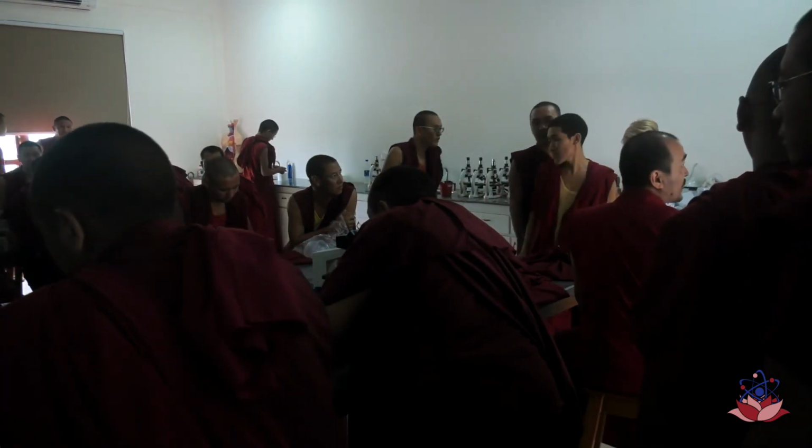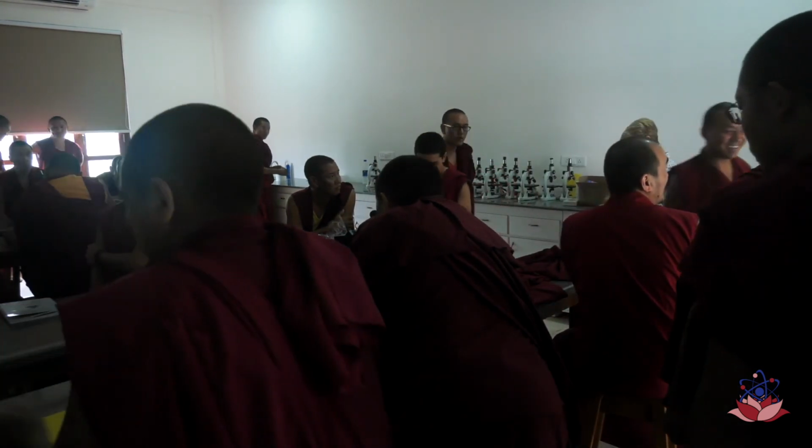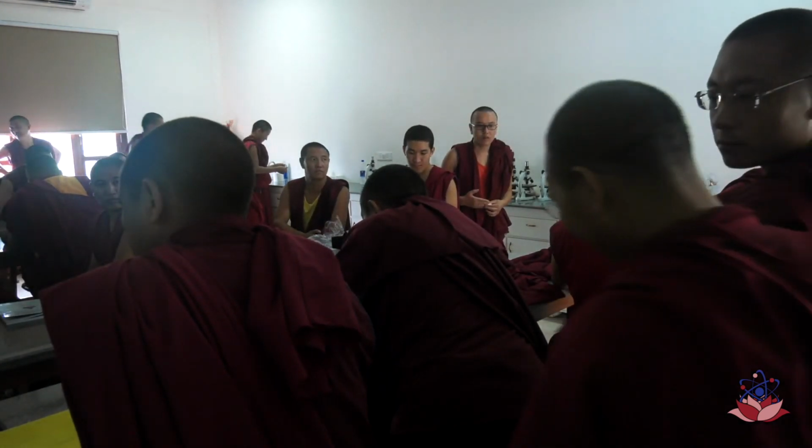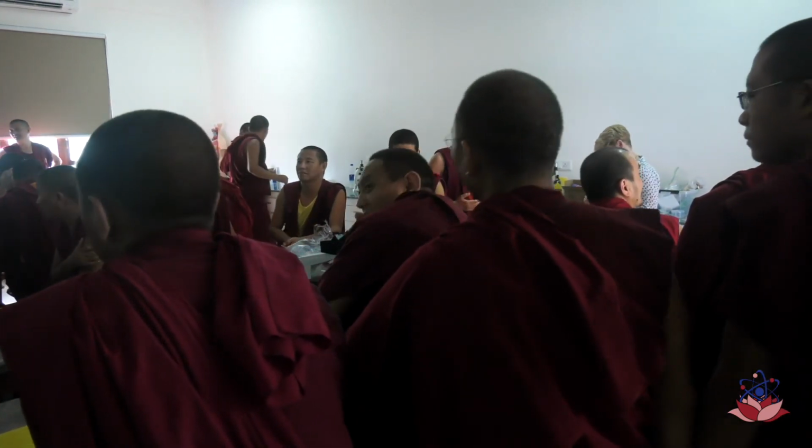So the blue ones are white blood cells, and the others are red blood cells. Right? What kind of white blood cells? I can't tell.